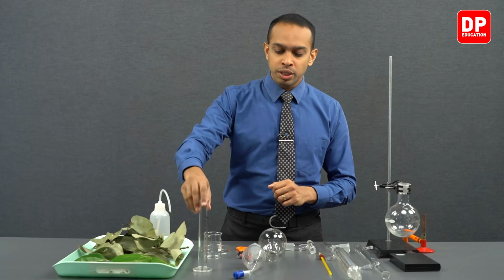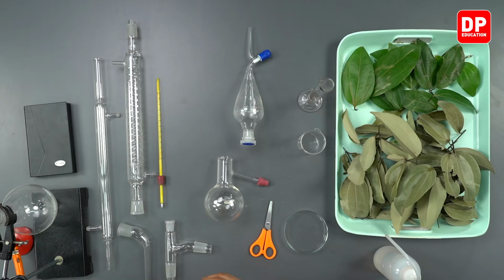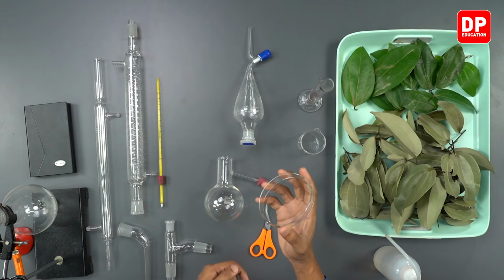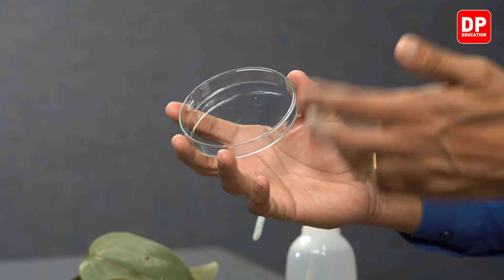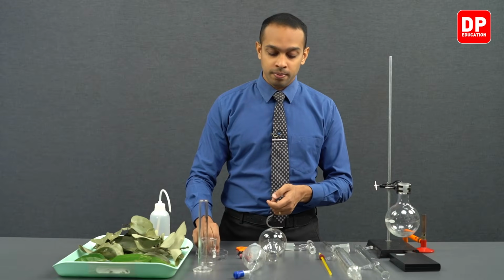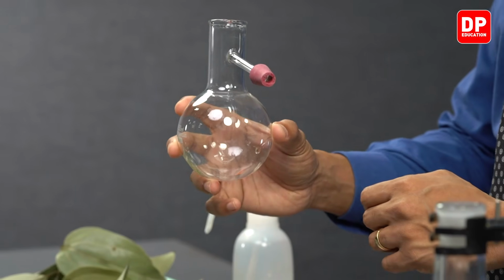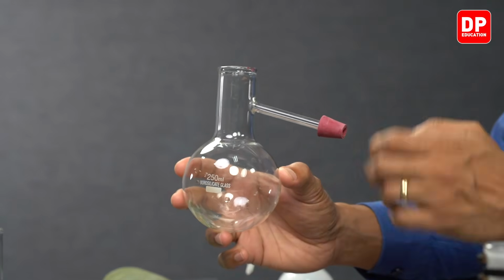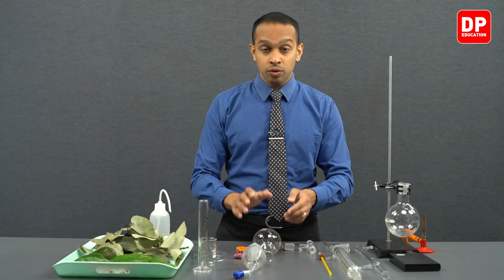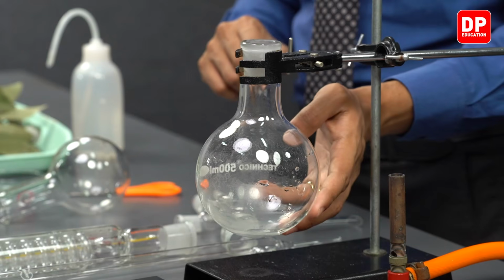Apart from that, we will be using a measuring cylinder, a beaker to measure the cut pieces of cinnamon leaves, or to measure the mass of the cinnamon leaves. We'll be using a petri dish. When carrying out the distilling process, we will be using a distilling flask. We will also be using a round bottom flask for distillation as well.